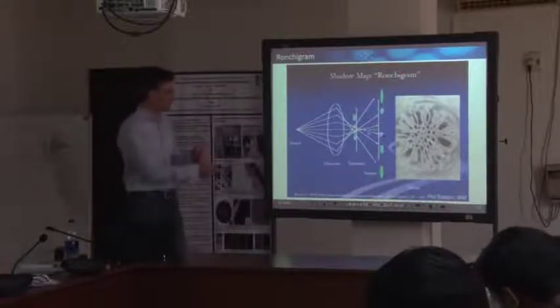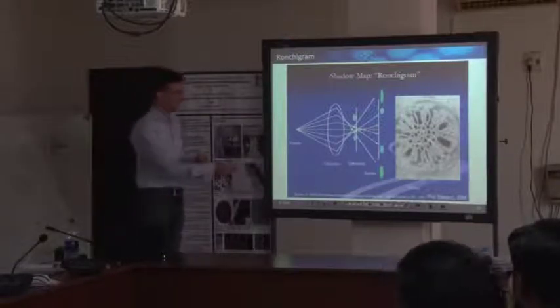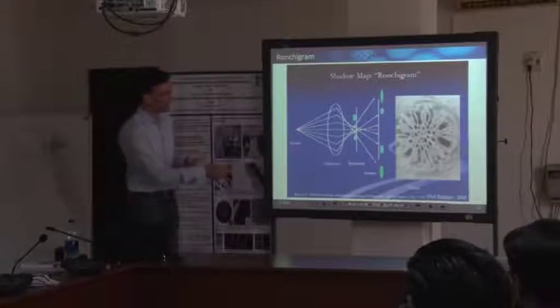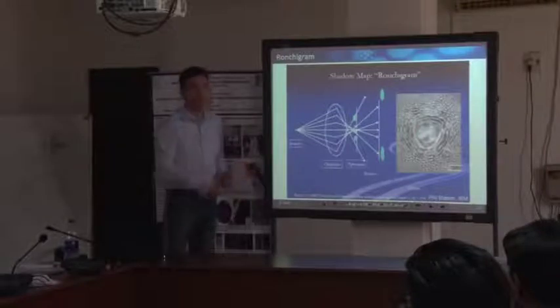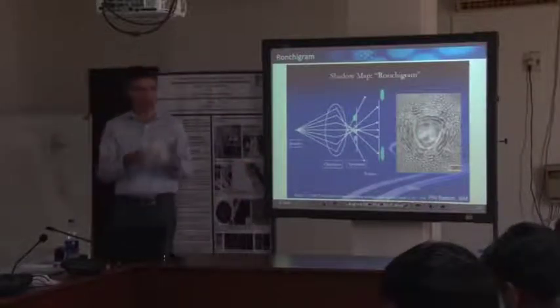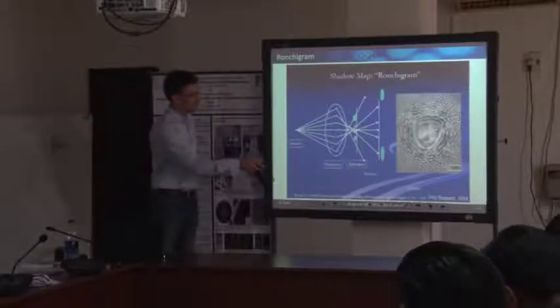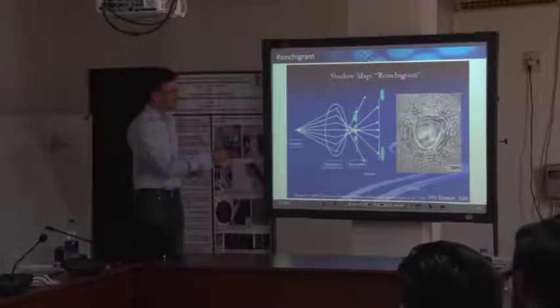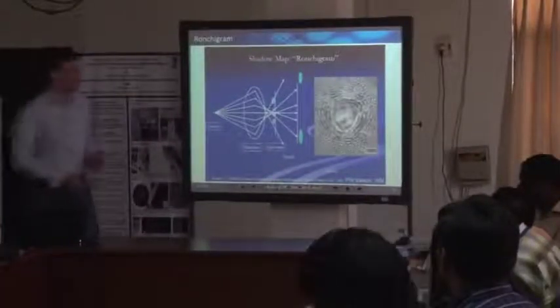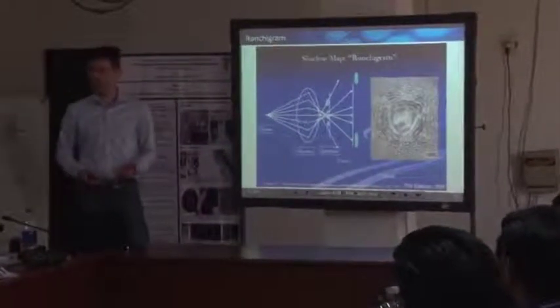And how does the shadow image of such a very small area look like? There's hardly any contrast anymore because we don't observe such features. This is gold particles and so on, it's important to see a clear shadow image. This is how it looks like if you focus well on your sample. So you end up with an almost infinite magnification in this inner region of your sample. This is well focused here now, but these outer regions here still show the sample at a finite magnification. Okay? And this is, in principle, I would say a perfectly aligned probe already.